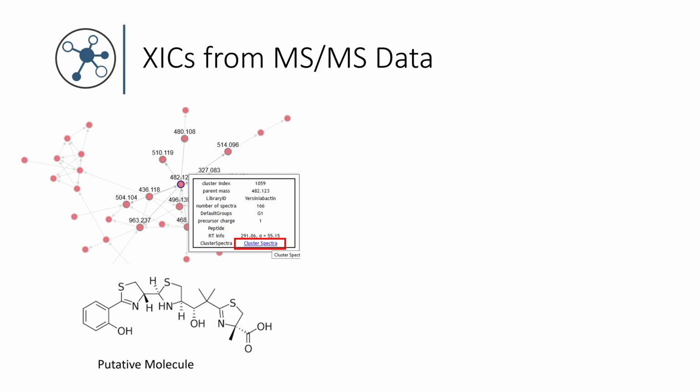And so I want to walk through an example that Danny went through. He went through this analysis process using the dashboard, and how it could have helped him, and hopefully you all can see parallels in your own work. Just one particular example: Danny was analyzing a particular set of LCMS samples, and he created a molecular network. Don't worry about the details of the molecular network, but bottom line is he found a particular molecule, the structure shown here, and he thought this was interesting and wanted to make sure right then and there that this was a real molecule.